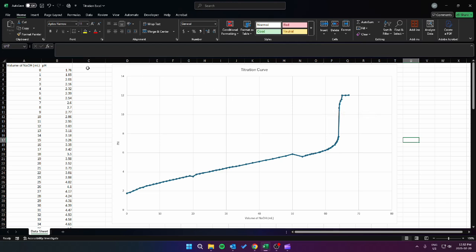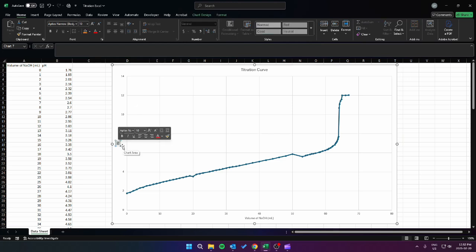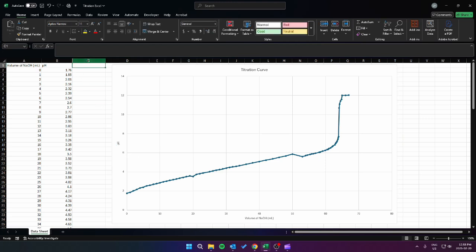And so over here in our Excel, oh, sorry, I noticed I made a typo here. This should be a lowercase p, pH. So in column C here, we want to add a new column to our data called slope. And just a review of how to calculate slope, that is y2 minus y1, all of that in brackets over bracket x2 minus x1. Right, slope is our rise over our run. It's our change in the y over the change in x.